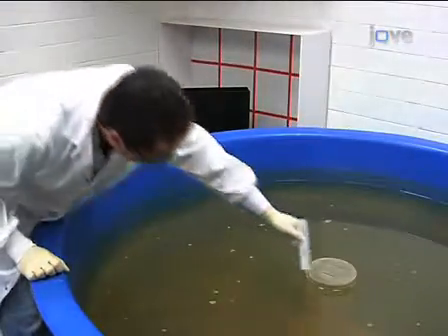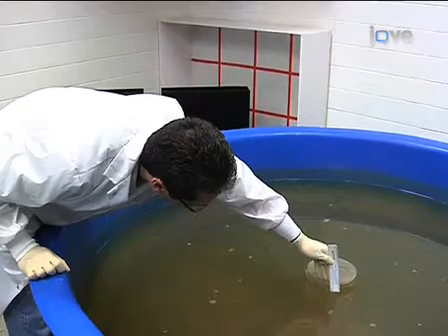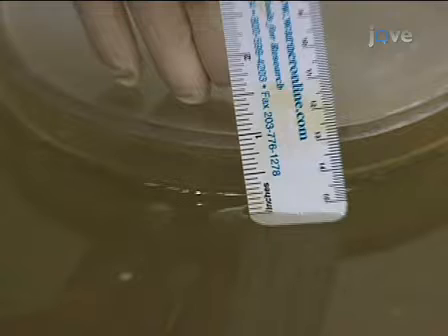Place the escape platform in the center of the pool. During training, it can be exposed about one inch above the water. This teaches the rat there is a platform, and that is the way to get out of the water.